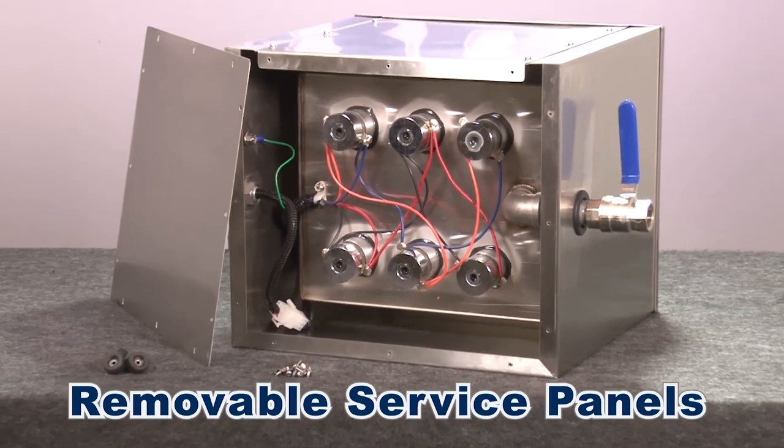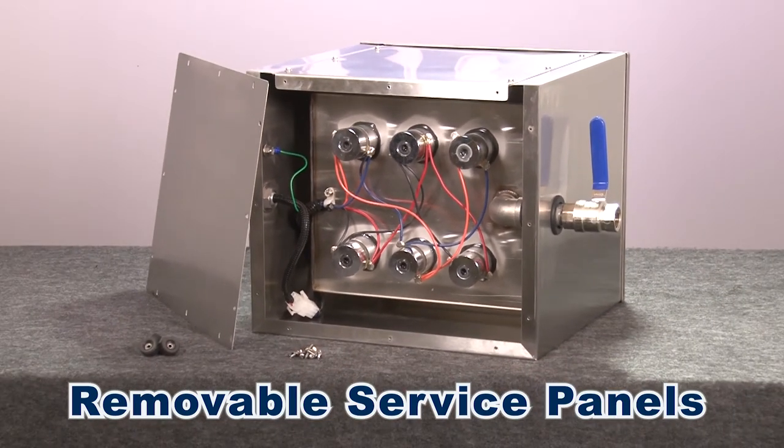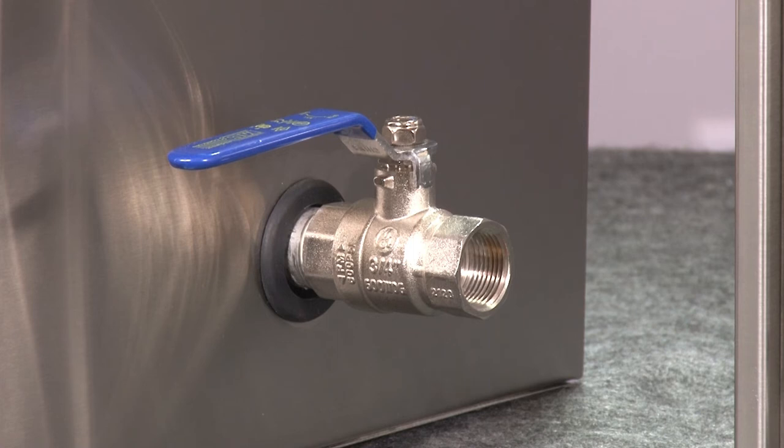The tank has removable service panels for easy service and ball valve drains for efficient and quick liquid discharge.